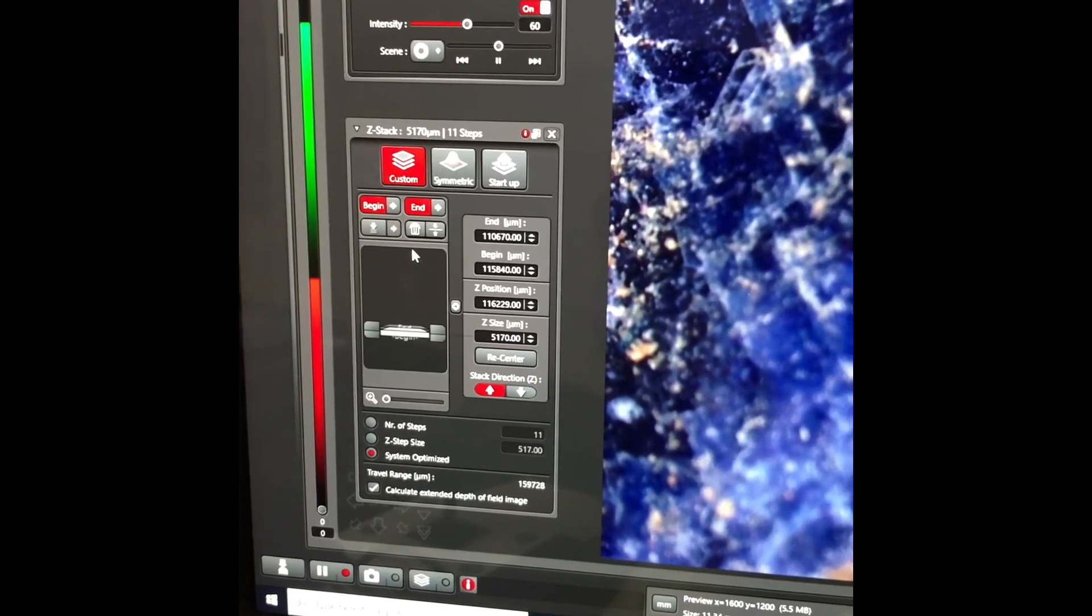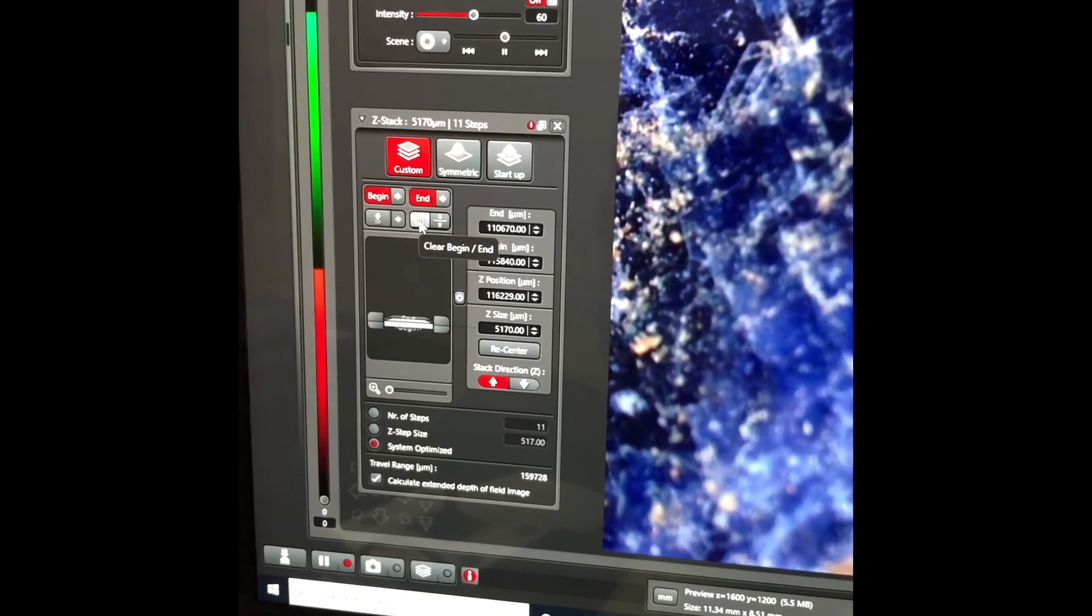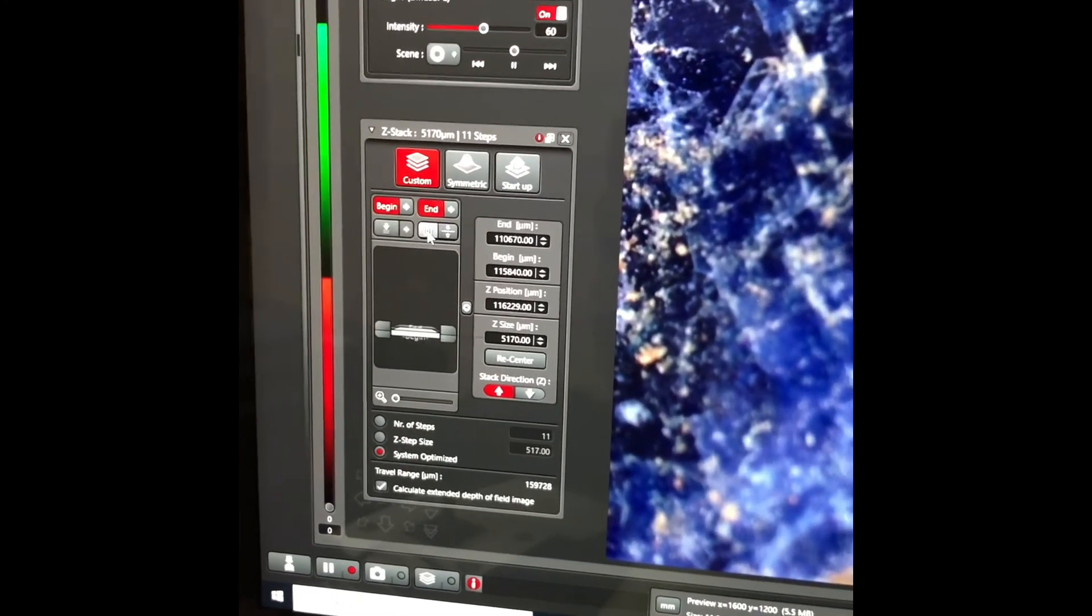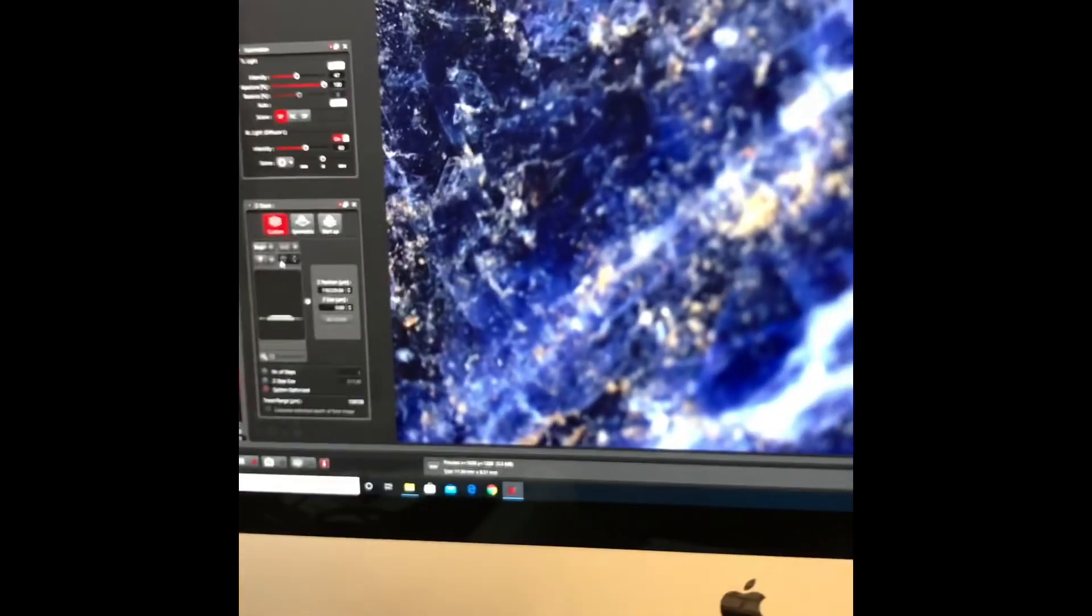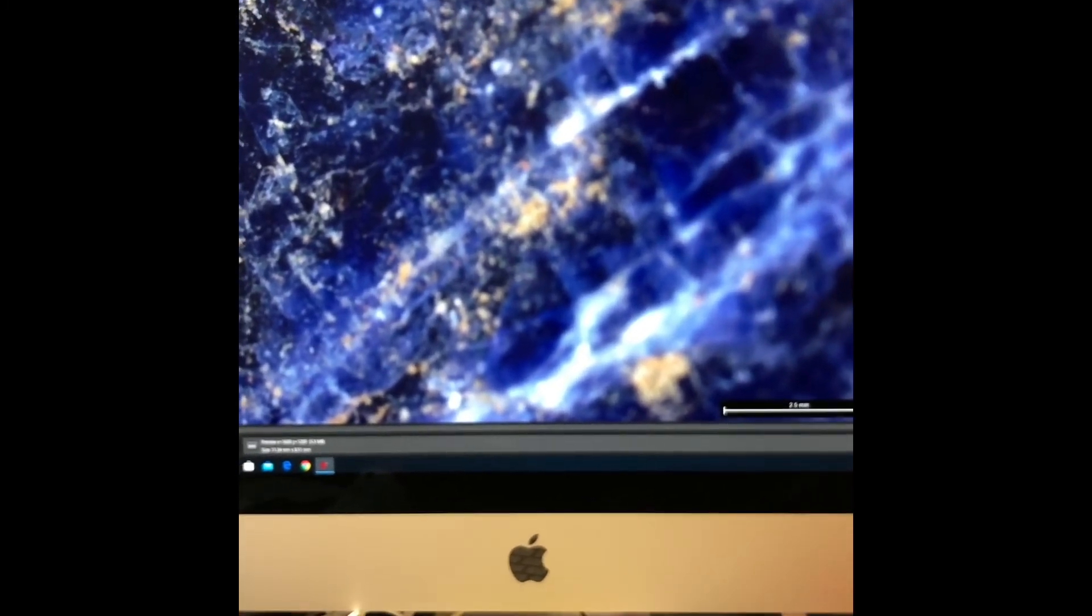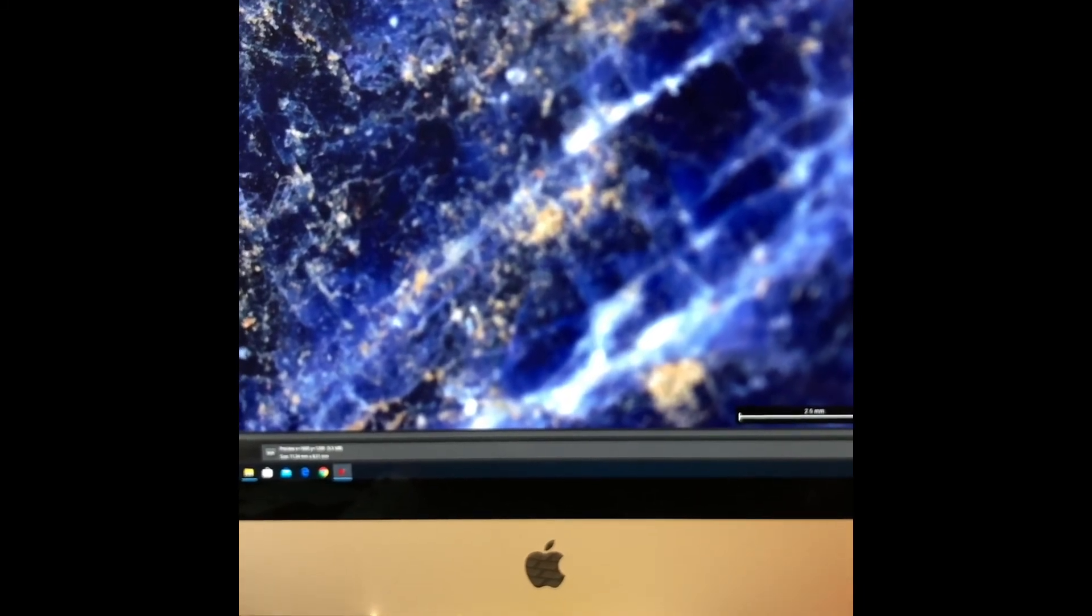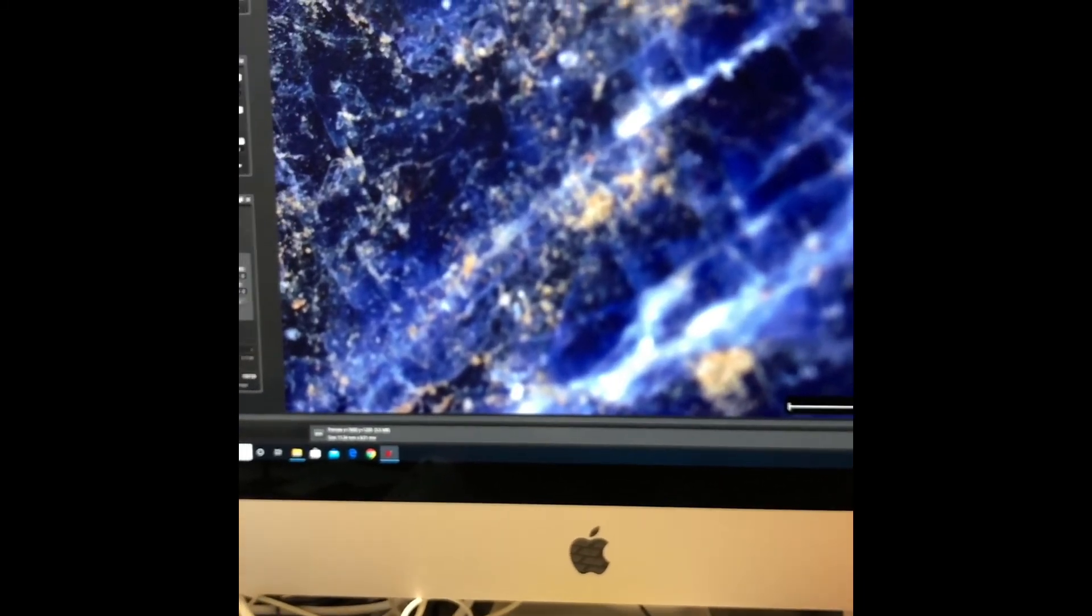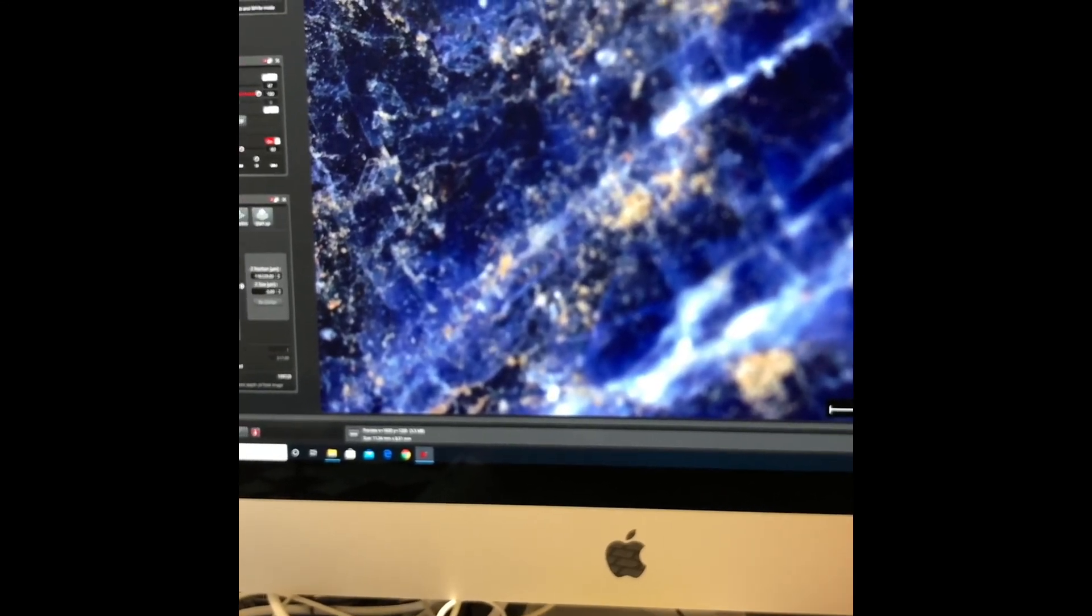The first thing to do is clear any old information that might be on the system. To do that, you press the bin button. The next thing you'll have to do is set the focal range. You can either start at the top and go to a lower position or start at a lower position and go to the top. The software will be able to determine whether it's going up, down or bottom up.